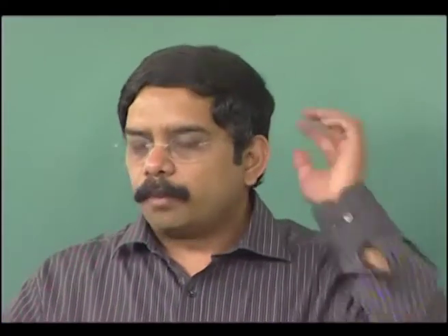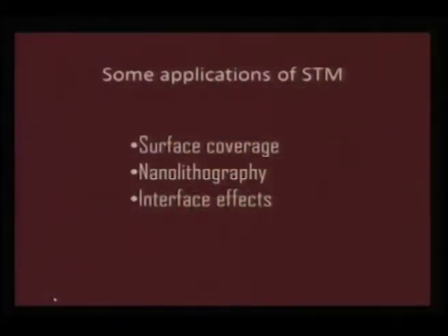I have already discussed these slides in module 2 while discussing molecular beam epitaxy, but today I am going to show some of those results again, and tell you how to map those depositions. So, the first application is on surface coverage, and another popular area where STM is playing an important role is in nanolithography, and also we can look at interface effects. So, we will go through some of the applications of this technique.